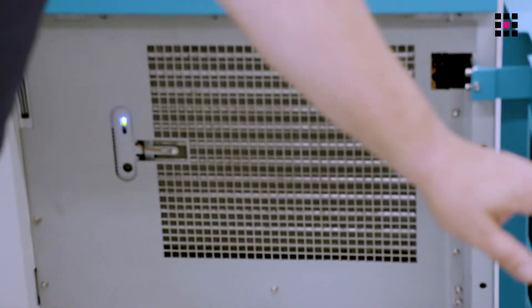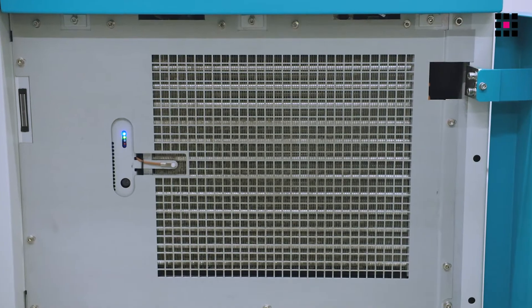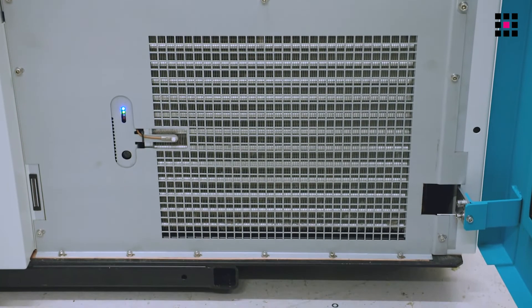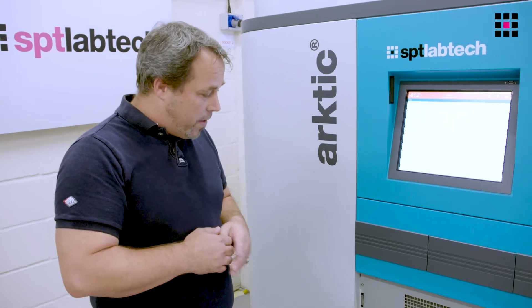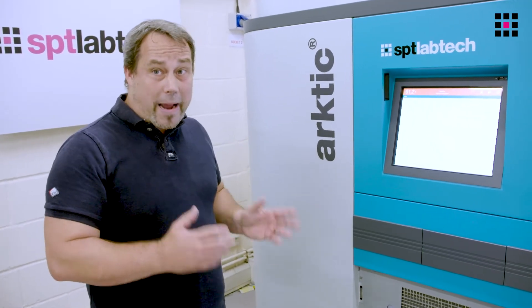The upper refrigeration system is minus 80, that's known as a master, so that runs predominantly most of the time. And then we have a full backup, which is at the bottom, which runs less or fewer hours than the master. If anything happens to either one of them, the other one cuts in straight away, so that's your backup system.